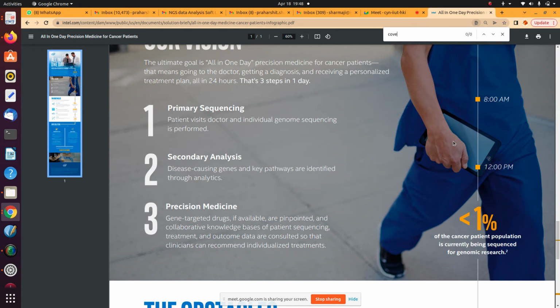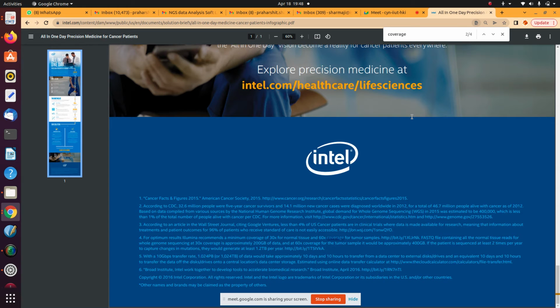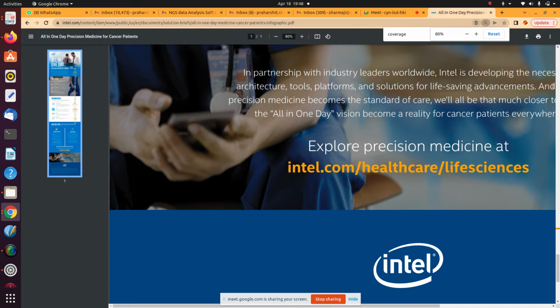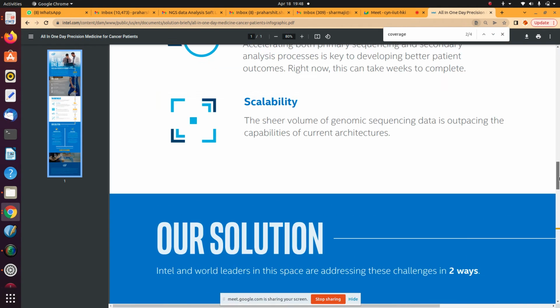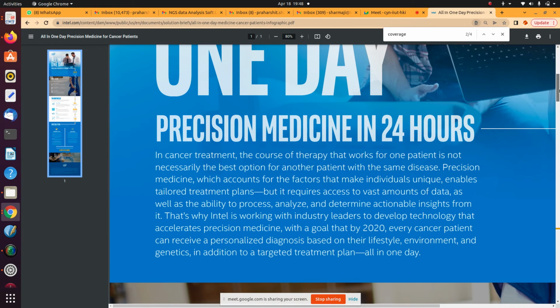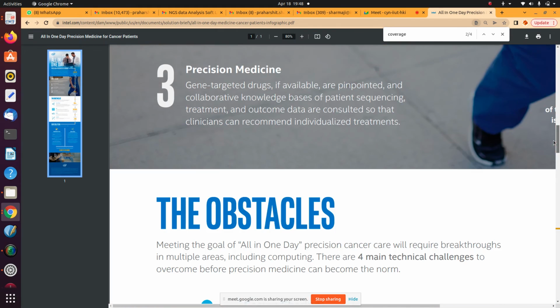Let's check for coverage quickly. Coverage is 30x for optimum results. Yes, it is there, 60x coverage. Is it? Where is this? Okay.